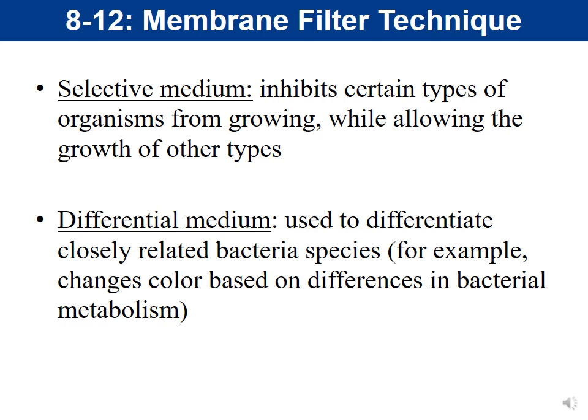You'll notice that this section of the class is not going to be your biochemical sheets. In this section, it's not substrate, enzyme, products, color change, etc. When you're studying for these types of tests, you're going to want to study what the ingredients in the media are that are responsible for the result.